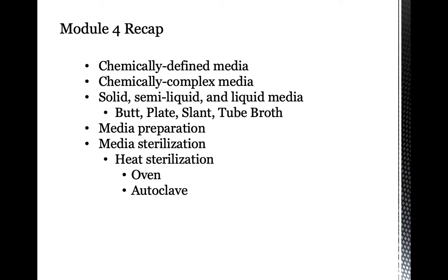Then you observe also how heat is important for media sterilization. Standard sterilization in the lab is via the autoclave, where the parameters are 121 degrees Celsius, a pressure of 15 pounds per square inch, and a sterilization time of 15 minutes.